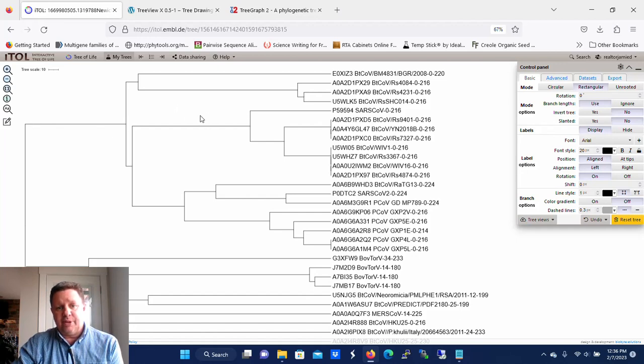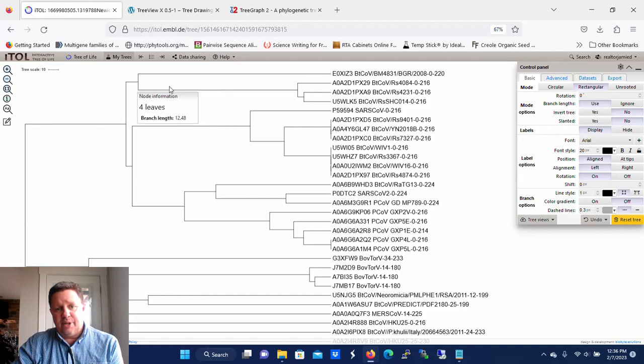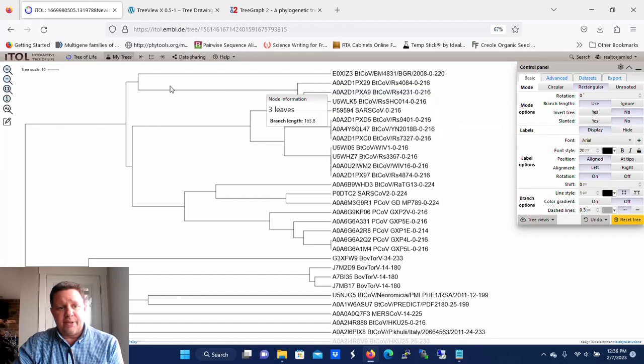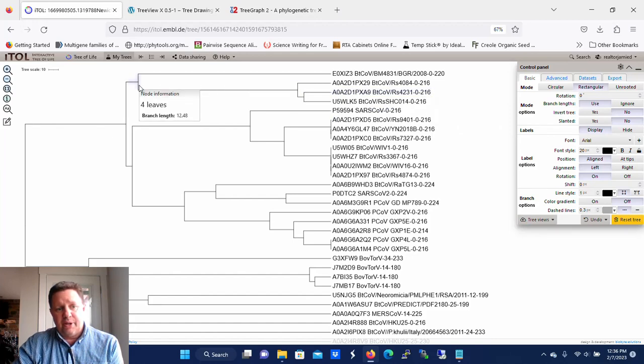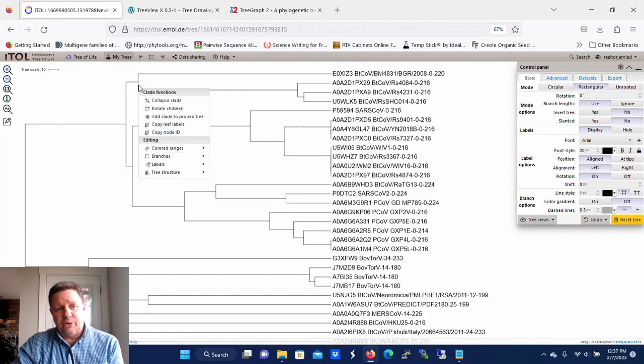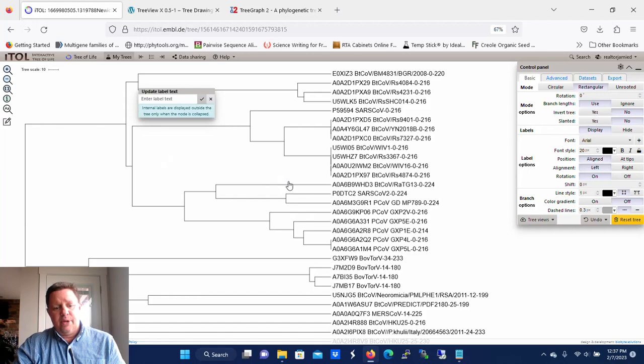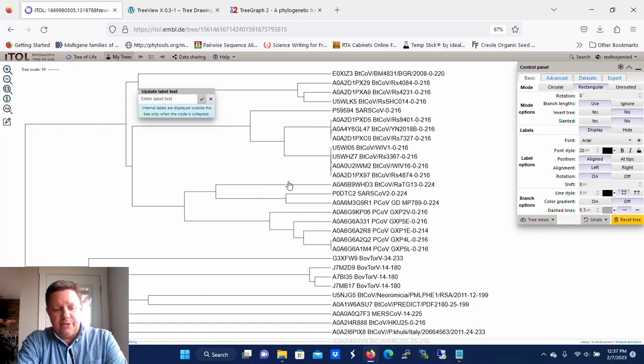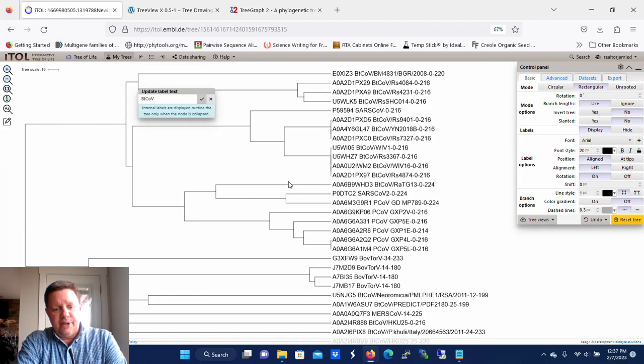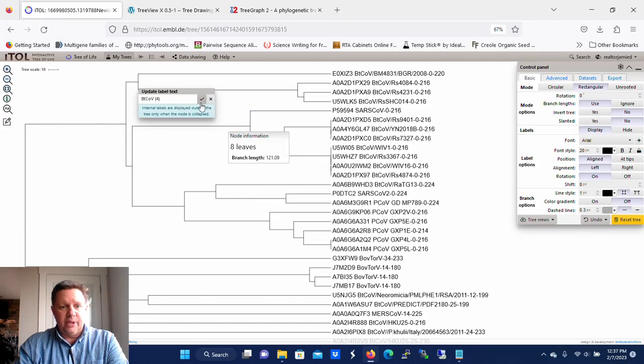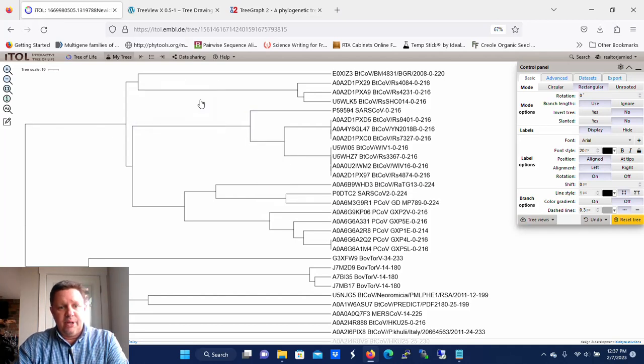There's a couple of things that you can do to display those a little more informatively. One of them is collapsing the clades. Let's say I want to collapse this clade here that has four different taxa in it. What I would do to collapse that is first I want to give it a label. In this case you click back here at this node and you go to Labels, This Node, Edit Label. These are coronaviruses, so I'm going to say these are beta coronaviruses and there's four of them here, so we'll just say Beta Coronavirus 4 as the label for that particular clade, and you're going to click check.